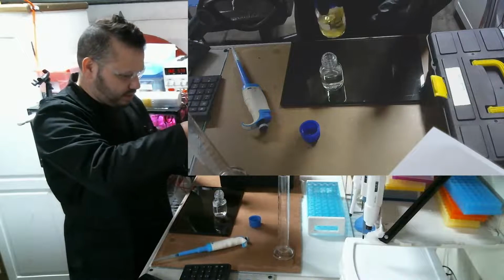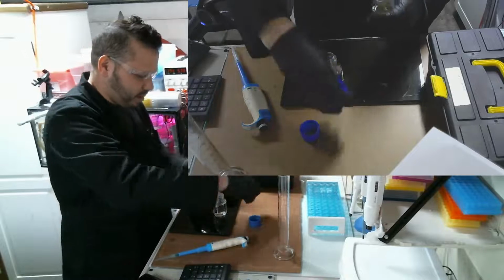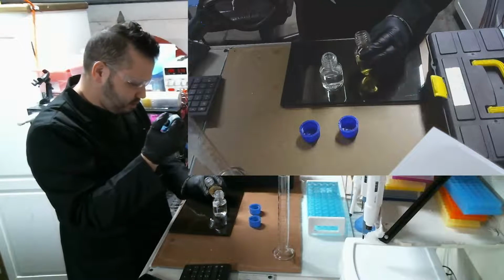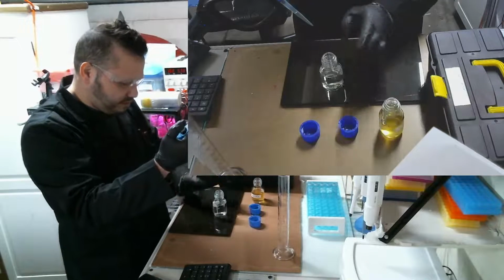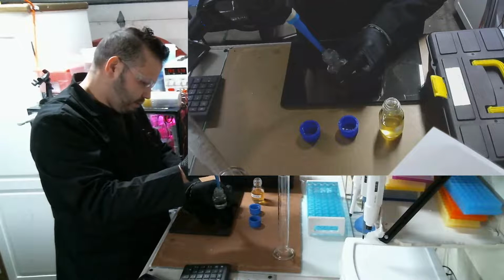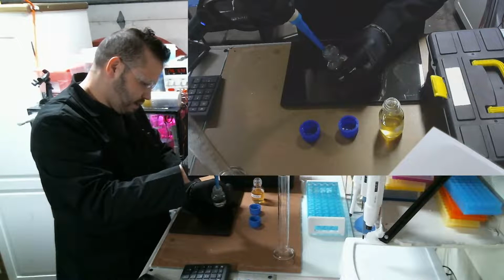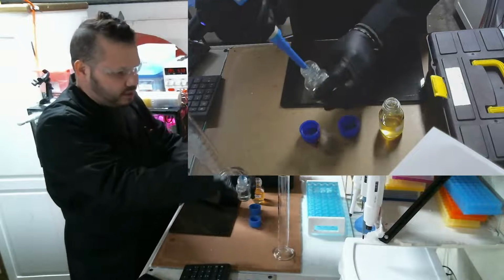Roll this around just to make sure nothing has settled, even though it shouldn't. 584, just double checking. Can't exactly reverse this if I don't do it right. I have my 584. Now I put it all the way into the water, and then I push it all the way, and then I bring it back and forth. Let's see if you can see that.